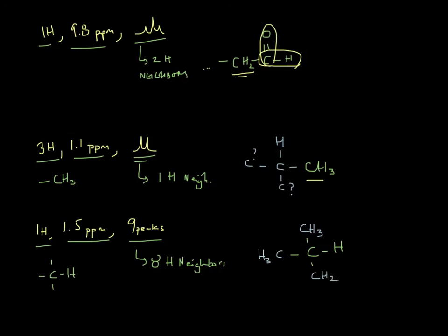So this is pretty interesting. That tells us, again, a whole lot about the molecule. We don't know what's happening down here because that CH2 needs to be attached to something else. But actually that signal right there tells us a whole lot about this molecule. Right? So this is where splitting, combined with integrals, combined with the location of the chemical shift, tells us a whole lot, and we can really start to tease out what these molecules are.